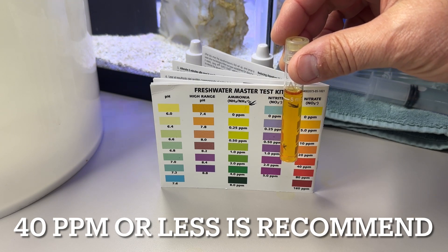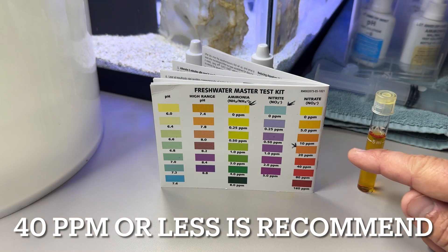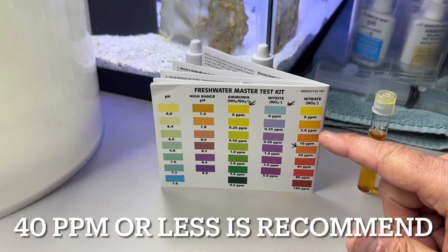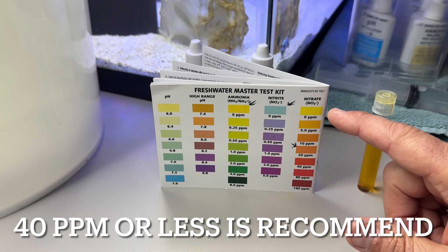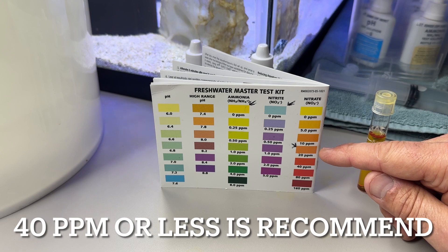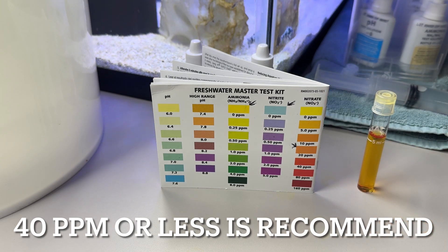If you look at this solution, it's clearly the second bar down in the orange — it's 5 parts per million. It's been in here a little longer so it's gotten a little darker, but it is 5 parts per million. The ultimate goal is to have zero nitrates, but if you have it at five to zero or even less than ten, you're doing well. Take corrective action if you get up to 20, 40, or above for sure. That's our nitrate test from the API water test kit — put your comments in the box below.